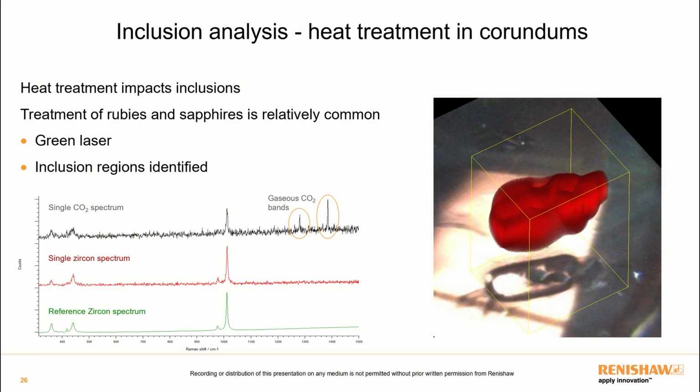From the dataset, we extracted one spectrum that was identified against the Renishaw mineralogical library, and the extracted spectrum has been used to generate, using component analysis, the 3D image.